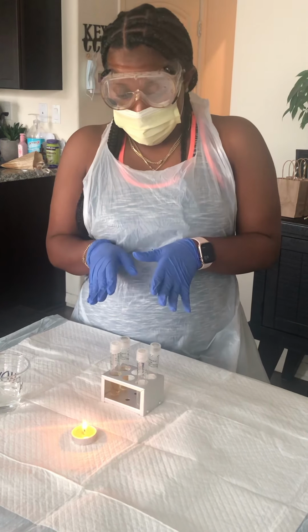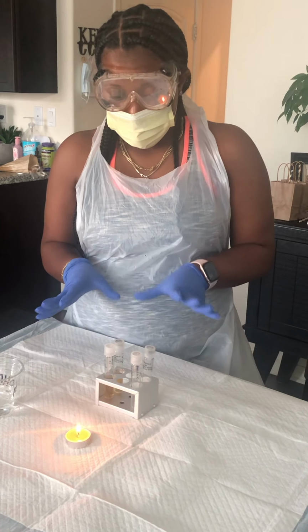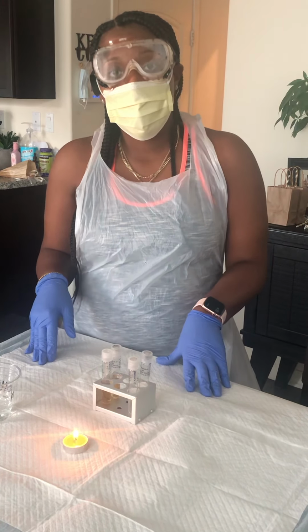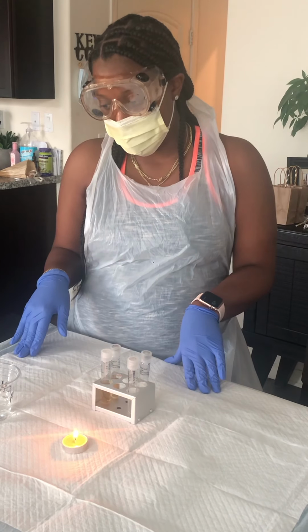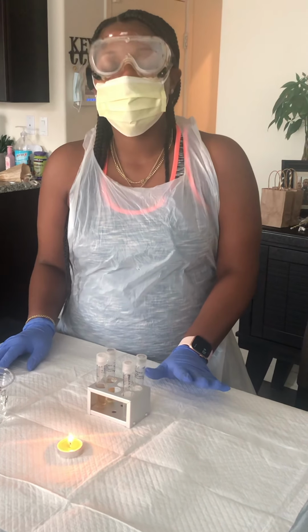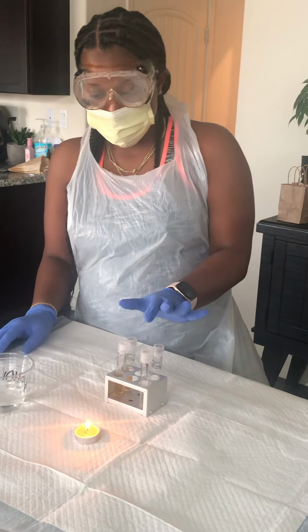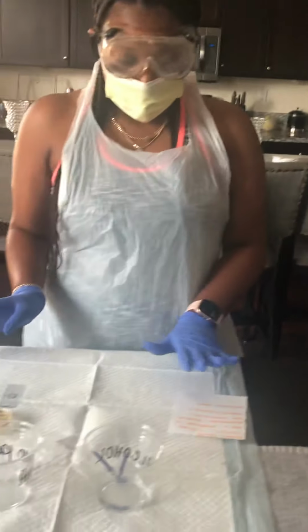We will repeat the same steps for the epidermis sample, and then we will place both samples in our incubation location for 48 to 72 hours, wait for growth. And then at that time, we're going to do the methyl-red and Voges-Proskauer testing. And we are going to take pictures of our slides and upload it to our data table. So that is it for exercise 1. Like I said, we're going to repeat the same steps for the epidermis. In the meantime, we're going to move to exercise 2.